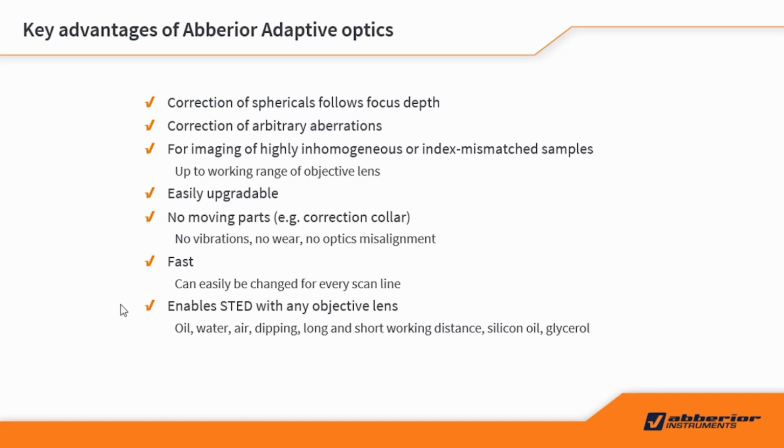And finally, I mentioned this, with the SLM, we can do STED with any objective lens that is out there and has a reasonable quality, be it an oil objective, water, air immersion, dipping lenses. We use objectives with long and short working distance, silicon, glycerol, you name it.